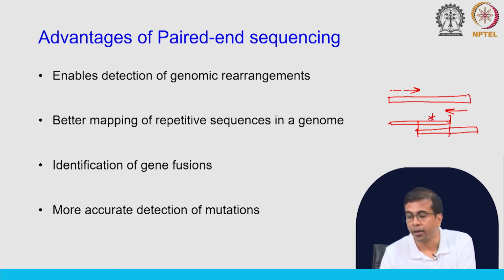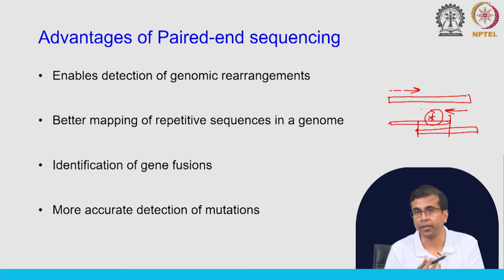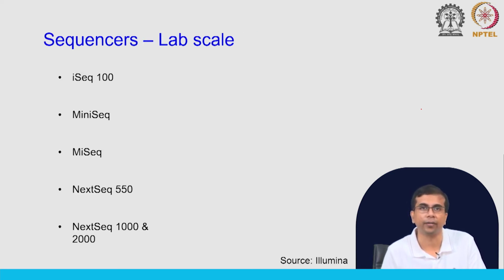But the other read or the pair here does not show that change. So, it will then tell us, okay, this is probably a sequencing error. Although the sequencing error rate you have seen is actually low, this happens. So, here we can identify that this is a sequencing error. Okay. So, in this way we can double check the data that we are getting, and this helps us in getting a more accurate picture of the mutations, and this is something we also do in Sanger sequencing.